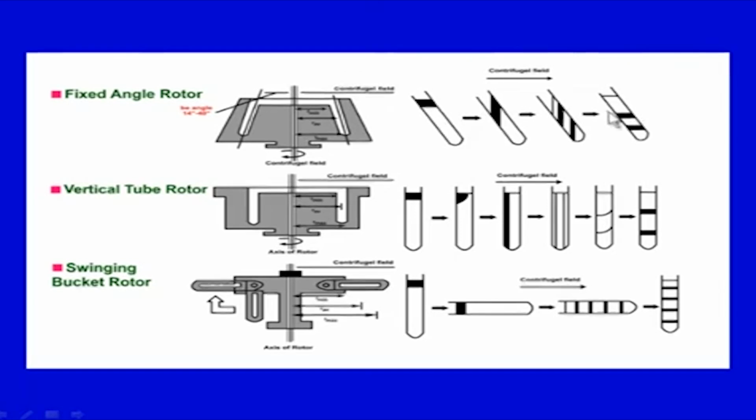So, these layers which were in this particular formation due to the centrifugal force will be in the resting position in here. So, you can see a series of representations for while it is at rest, while it is spinning, and then again when it comes to rest with the separated analytes.